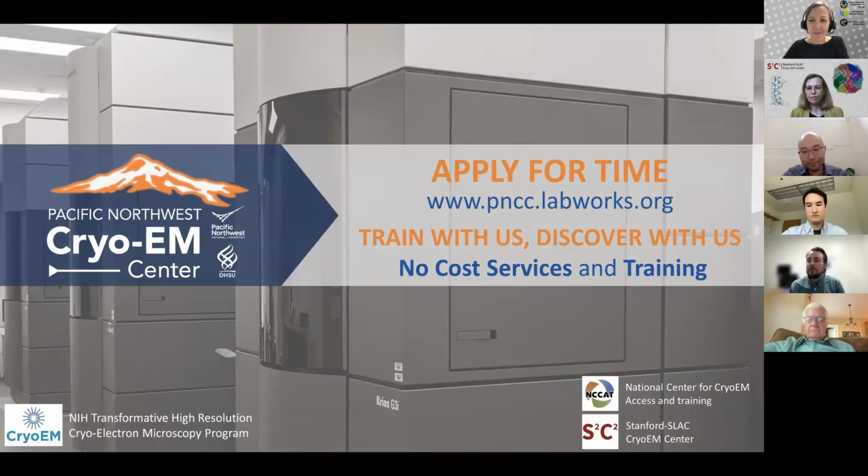Hello, my name is Sean Mulligan, and I'm a microscopist at the Pacific Northwest CryoEM Center. At PNCC, we have 5 cryo-TEM microscopes available to researchers. Our 4 Krioses are equipped with the latest generation direct electron detectors. In addition to all 4 having K3 and Falcon direct electron detectors, 3 of them are configured with Gatan energy filters, including the new BioContinuum.